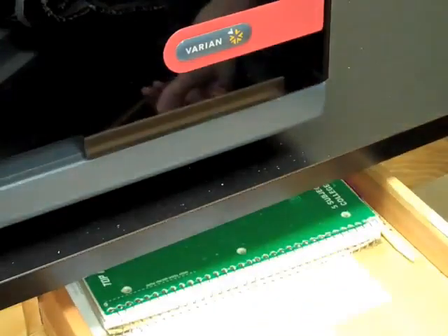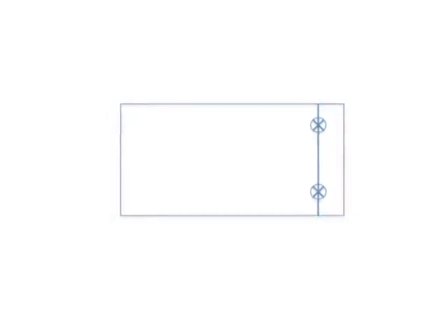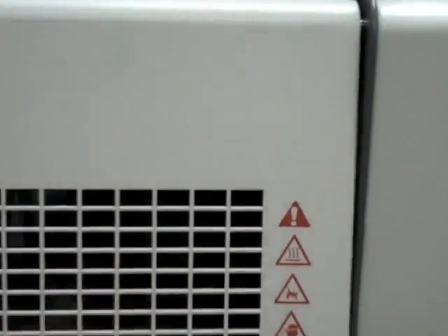In the right-hand drawer below the instrument, remove one of the Varian business cards. These cards have two targets printed on them that we will use to help us center the light beam along the center of the burner slot. Remove the safety plate in front of the burner.